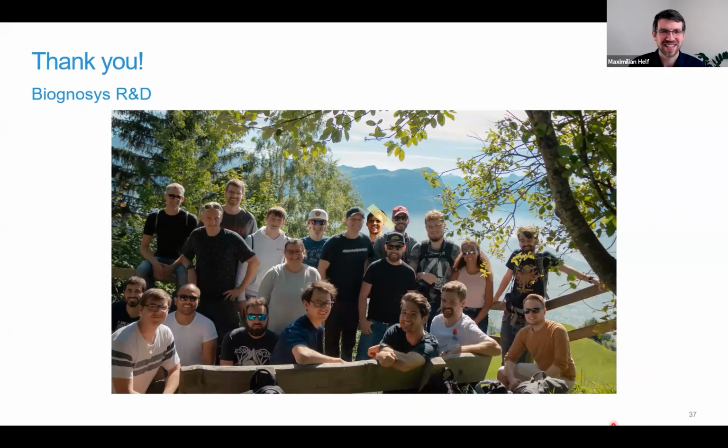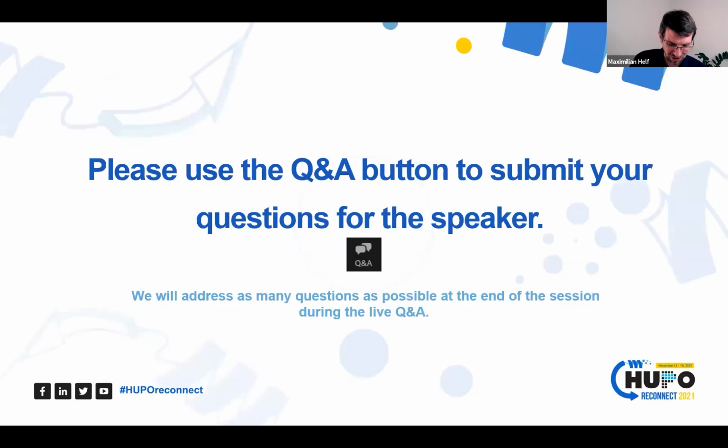Thank you very much, Takira, for this very nice overview of SpectroMine 3. And at this point, I would like to introduce our guest speaker, Erwin Schow from the Technical University of Denmark. He's been an associate professor at the Department of Biotechnology and Biomedicine since last year and works on hematopoiesis.